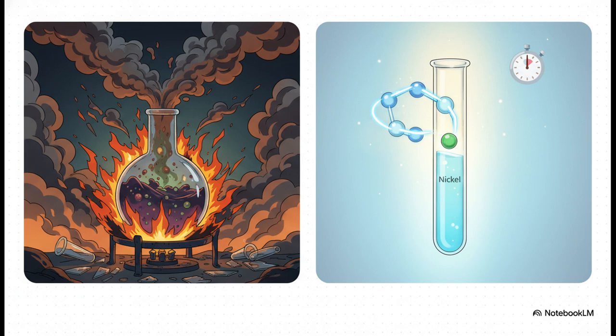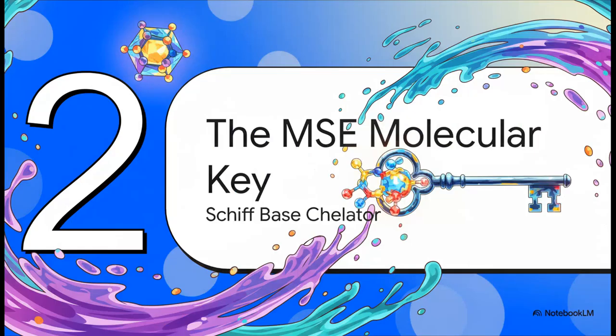Instead, we're looking at a novel complexation method. This allows for direct sample introduction using specialized chelating agents. It's elegant, rapid, and it's an entirely non-destructive chemical solution. A real game changer. All right, section 2, the MSE molecular key. Let's meet our chemical savior.